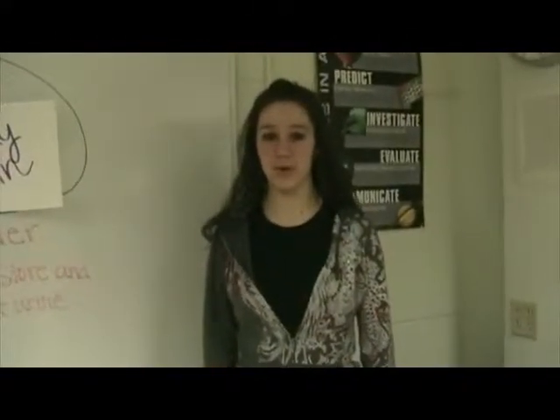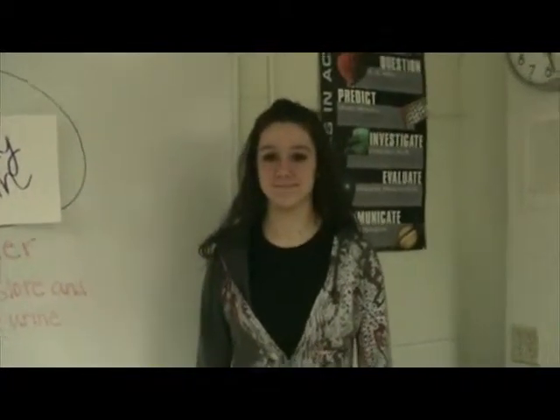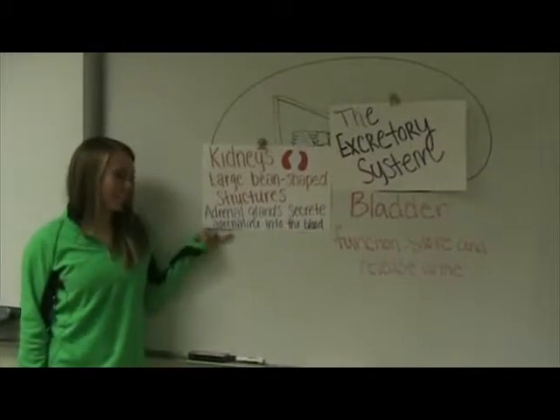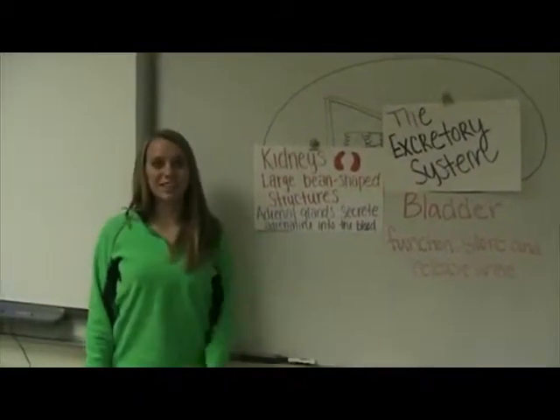The function of the kidney is to remove waste and water from the blood, balance chemicals in the body, and release hormones. The adrenal glands secrete adrenaline into the blood, so next time you go skydiving, you know what to think.